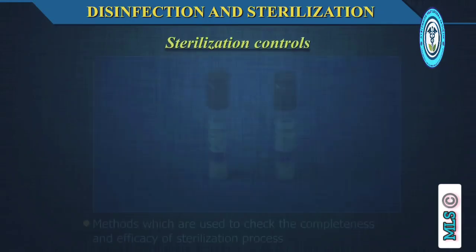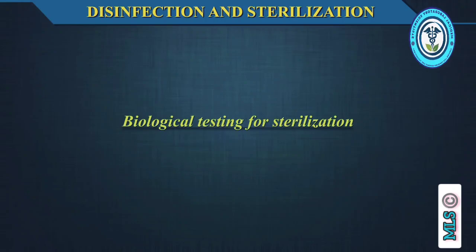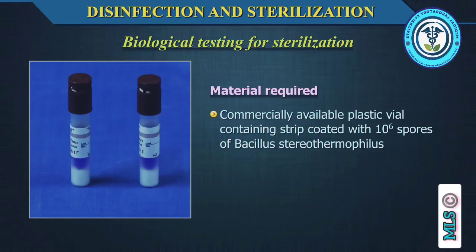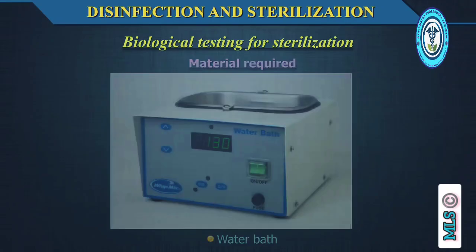Sterilization controls. There are various methods which are used to check the completeness and efficacy of the sterilization process and penetration of steam inside the test load. Biological testing for sterilization. It is done by using a biological indicator, Bacillus stearothermophilus. Material required: a commercially available plastic vial containing a strip coated with 10 to the power 6 spores of Bacillus stearothermophilus, an inner glass vial containing culture media, and a water bath.